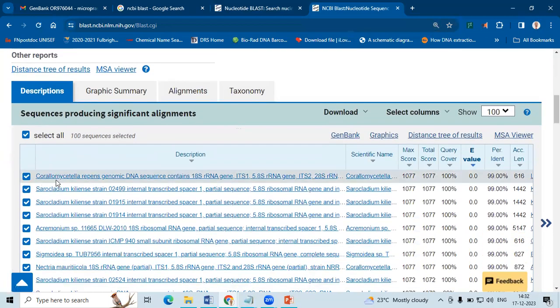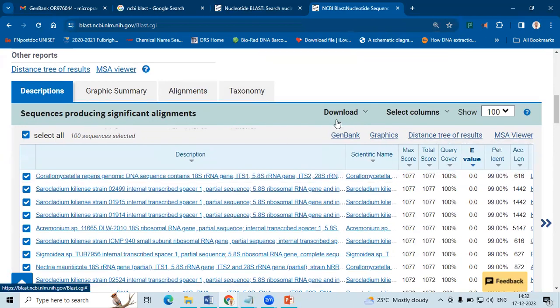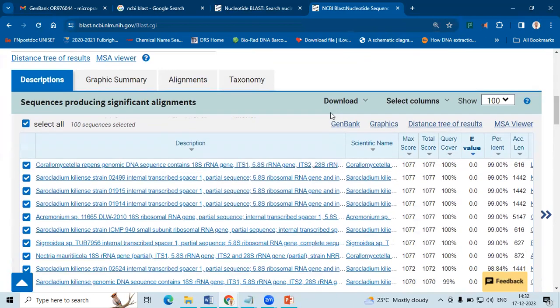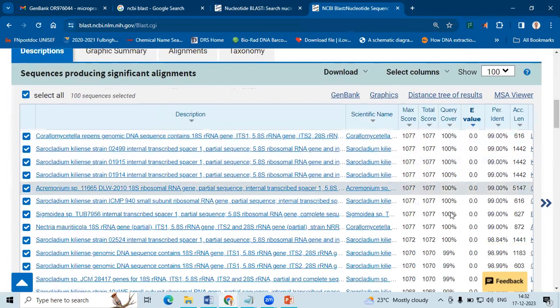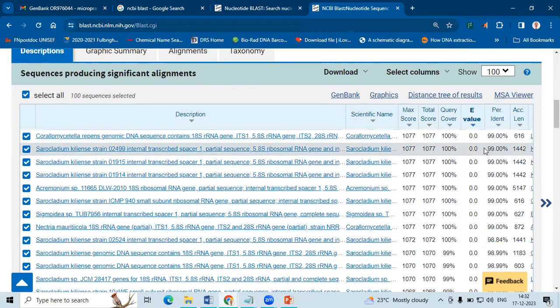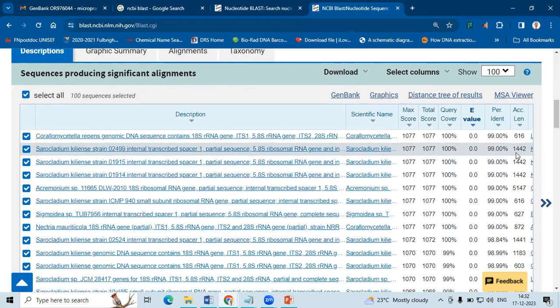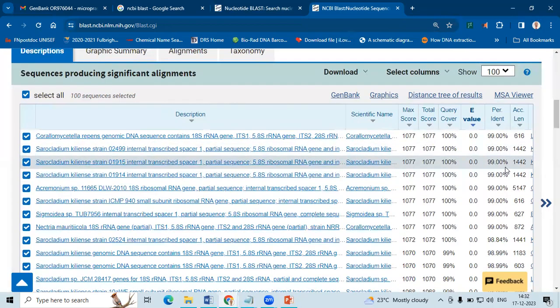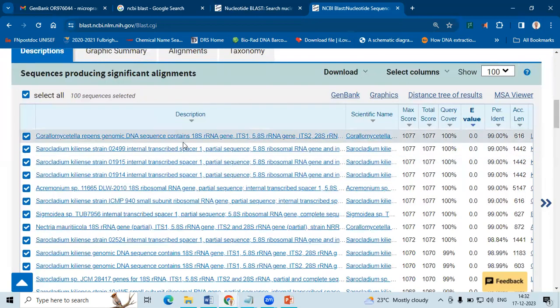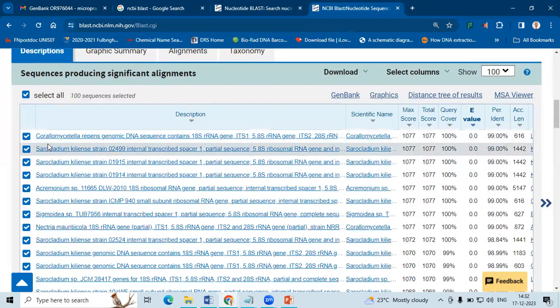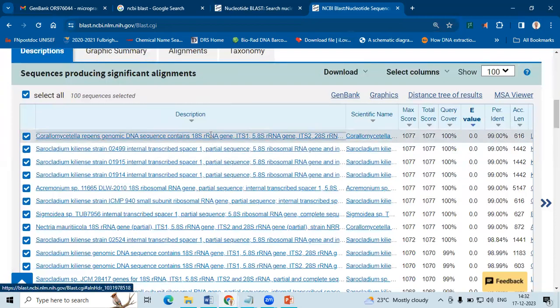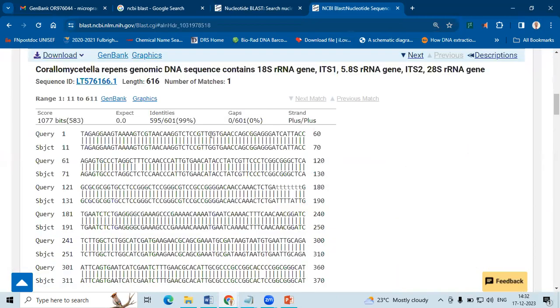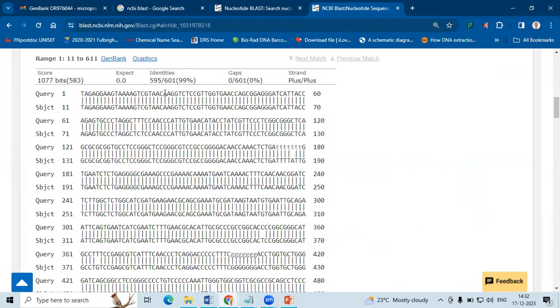So you can see the first result. Corallocytostroma reptans. Usually your sequence is Corallocytostroma reptans. You can also see many 100 percent query coverage and same similarity values are there. Here is when you can bring the phylogenetic tree and the other analyses to confirm that it is Corallocytostroma reptans. If I click this, you can also see the alignment button.